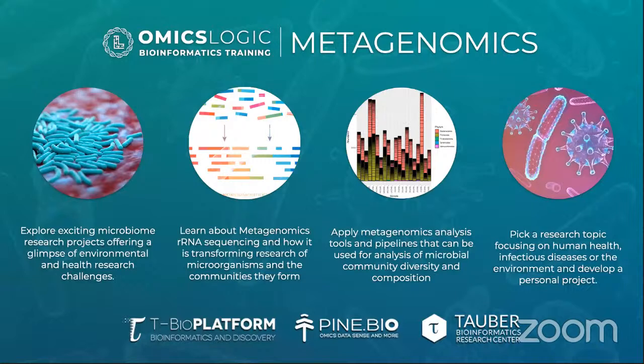This primarily includes metagenomic sequencing, which refers to high throughput generation of short sequencing reads that could either help us provide a taxonomic description of a particular environmental sample or study in-depth analysis of different genes that are being produced by a community of microorganisms.